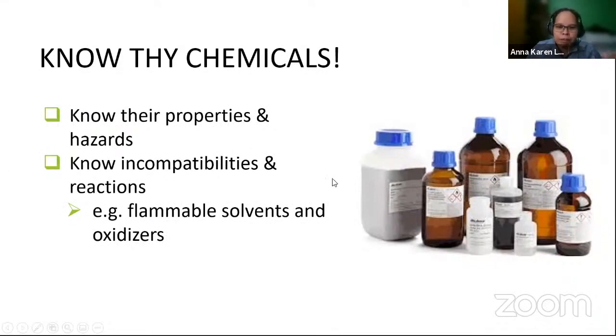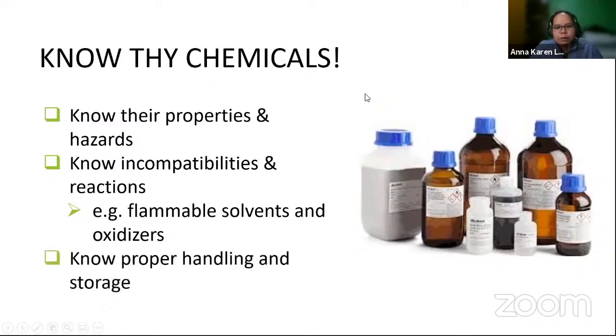So for example, meron kang flammable solvents and oxidizers. Definitely you cannot put them together. So oxidizers will definitely, when put together with flammable solvents, can cause fire. And so that is an incompatibility that I need to take note of. You also have to know the proper handling and storage of your chemicals. So depende sa chemicals mo, they will have different storage conditions, and we will cover that more in a bit.